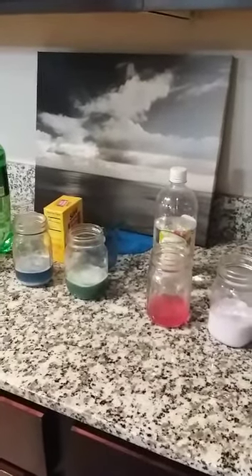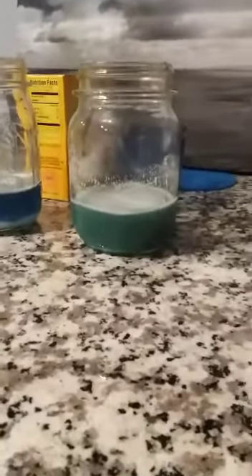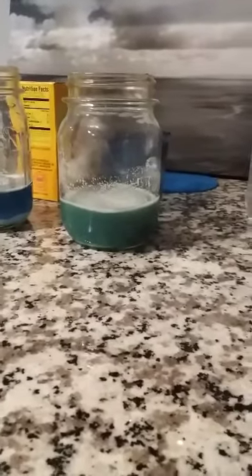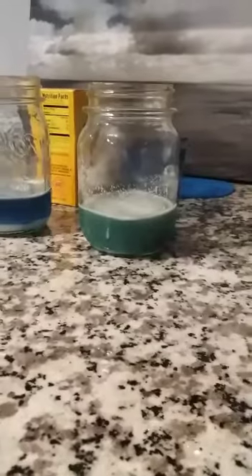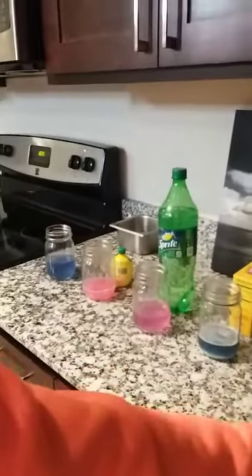A 2. Yeah. This is green. I have no idea what number to give it. What do you think? It's going to be at least a 6. 6? Maybe 7, because 7 is neutral. So we have red and blue, and I think that's a 7, because it's in the middle of red and blue.